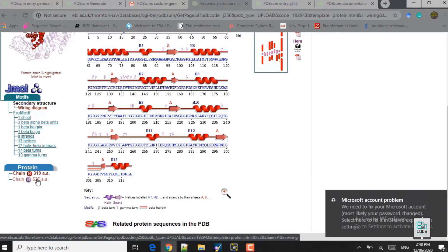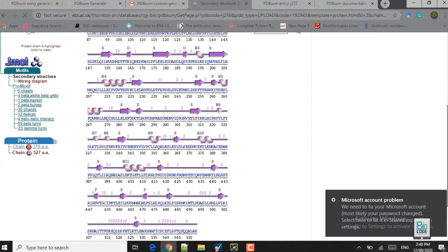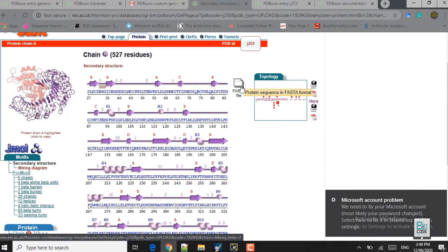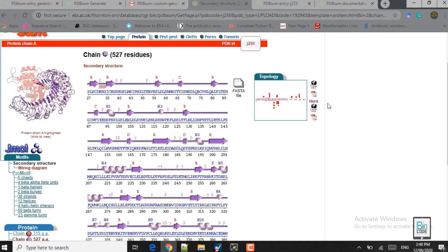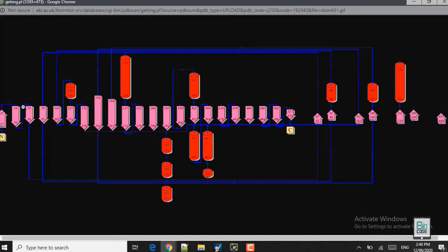Close this window. If you want to know about the secondary structure of the receptor protein, click on chain A and it will show the secondary structure: alpha helices, hairpins, beta strands, and beta and gamma turns. If you click on the first TOPS file it will provide you the sequence of the receptor protein in FASTA format, and if you click on any of the topology options it will show you the topology diagram.